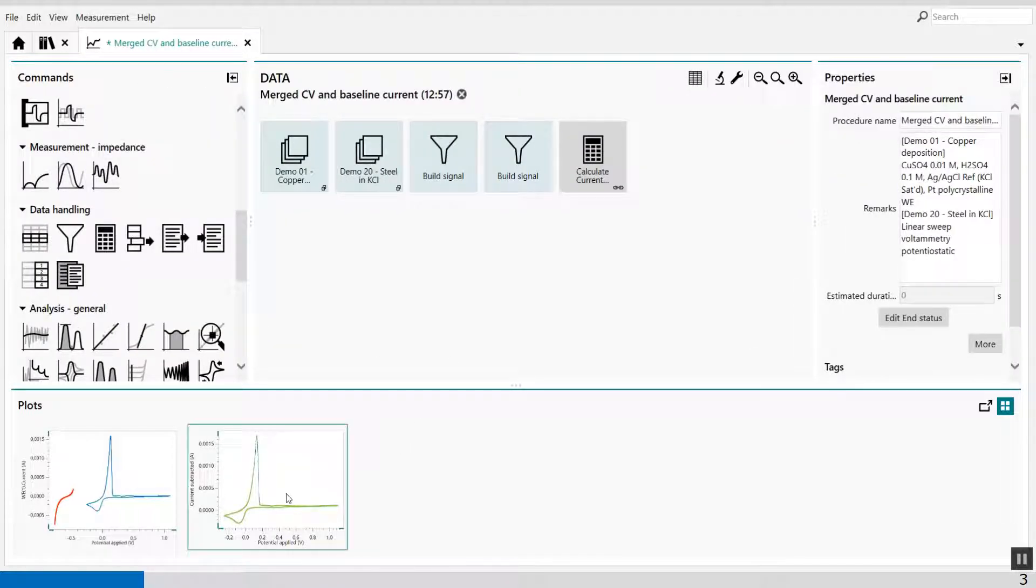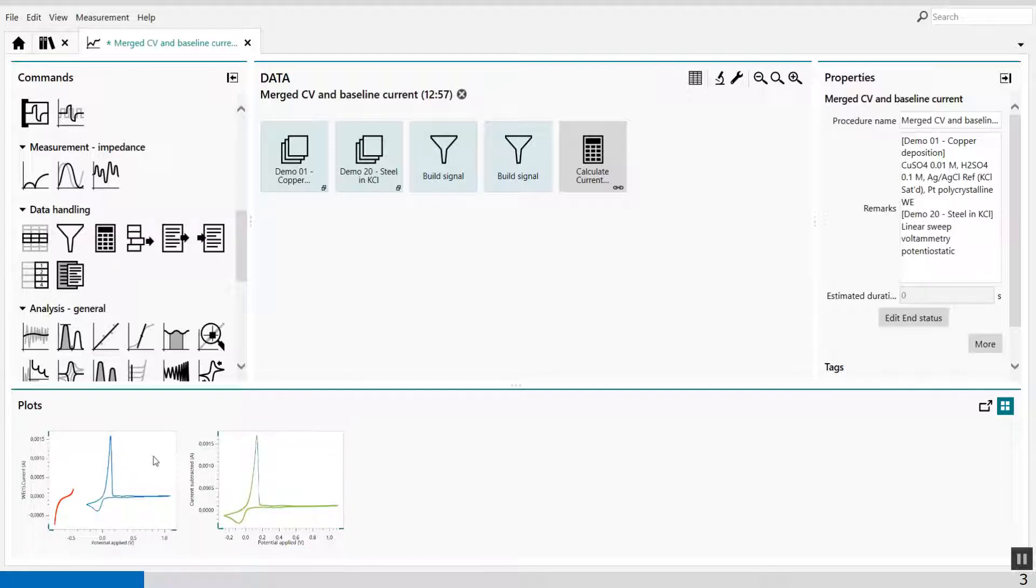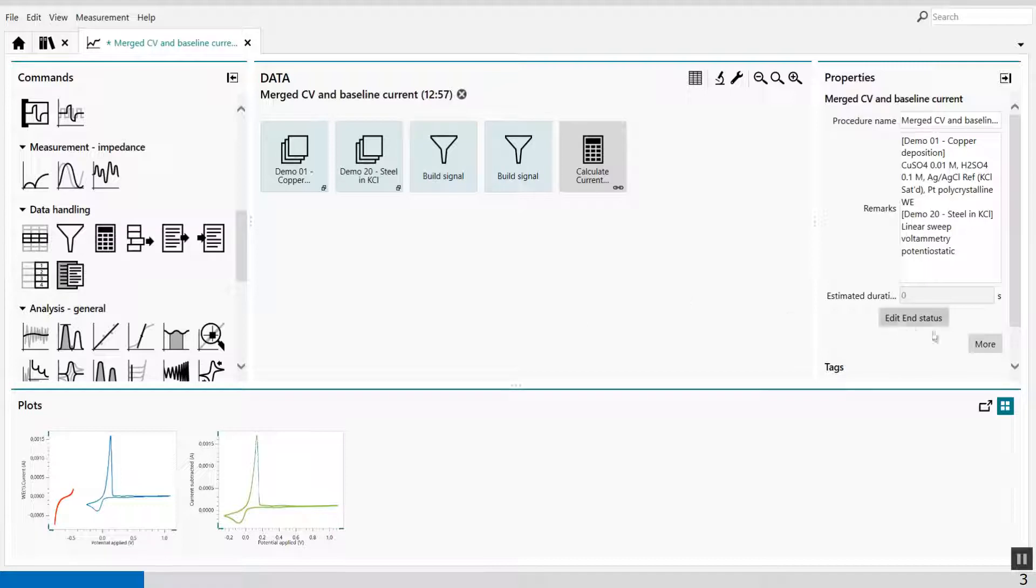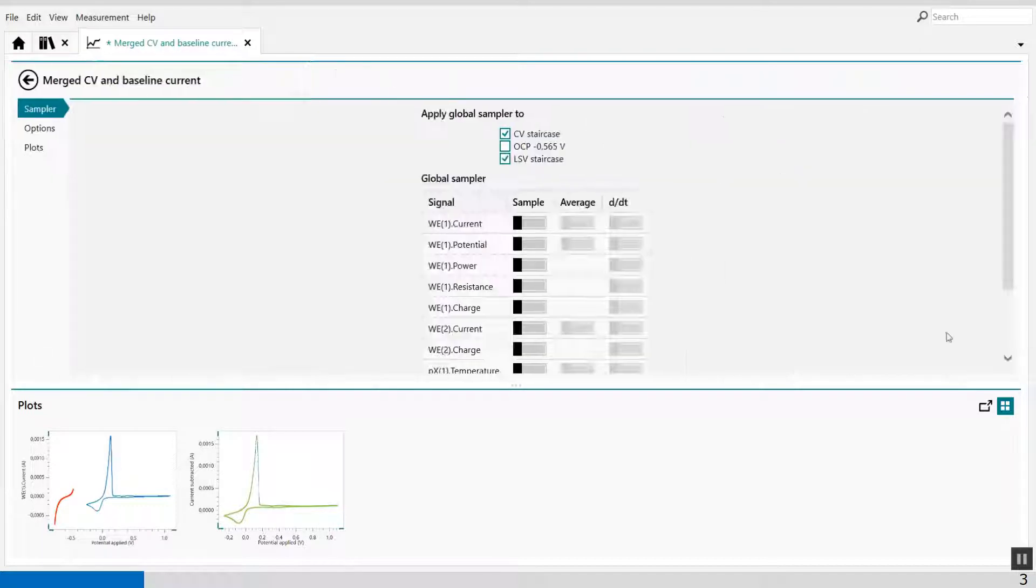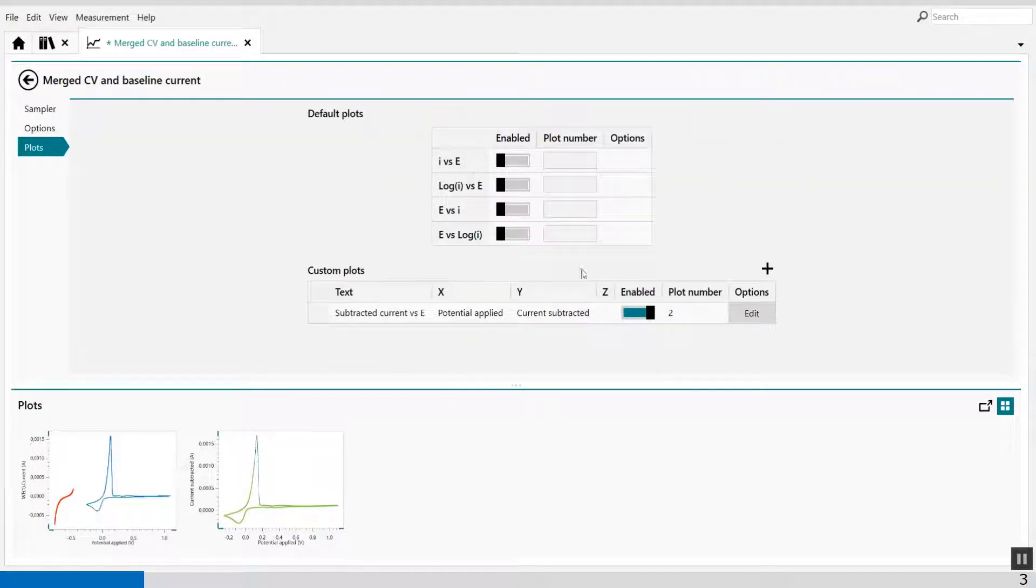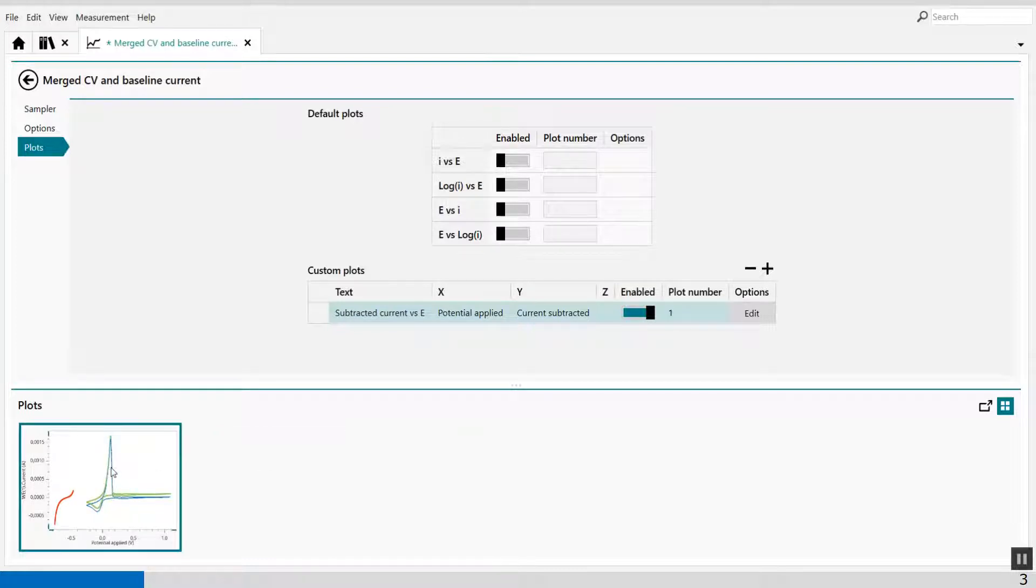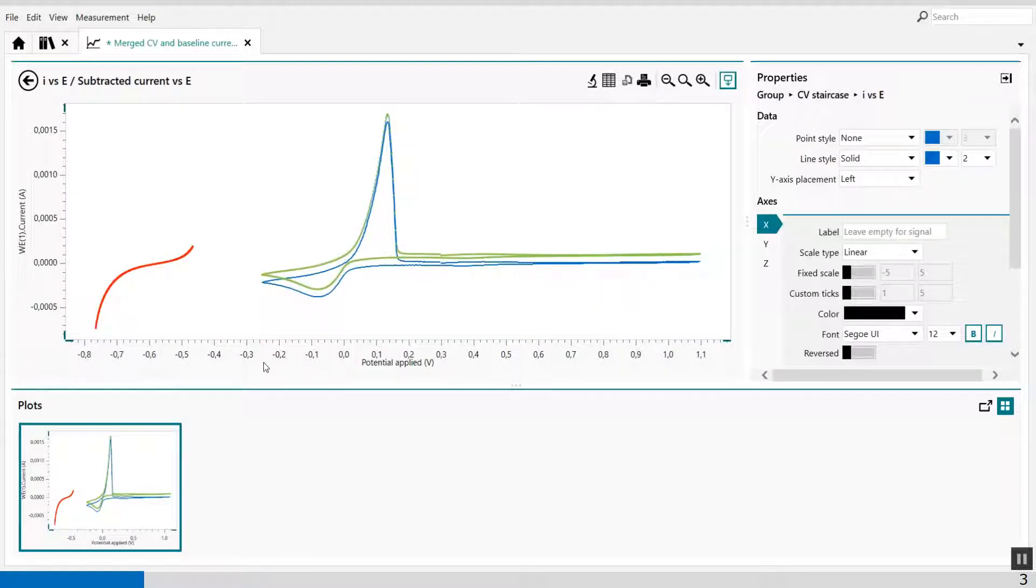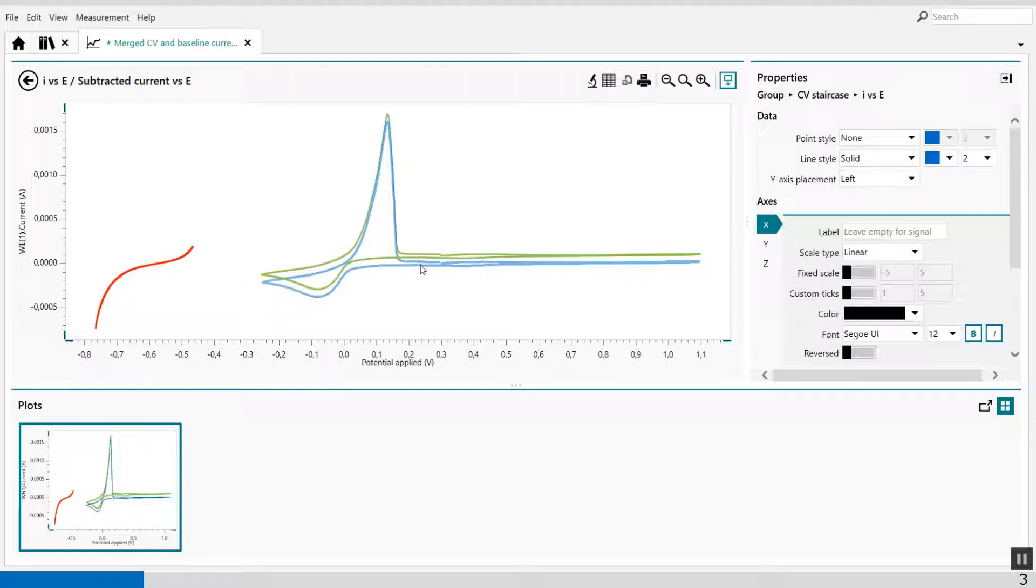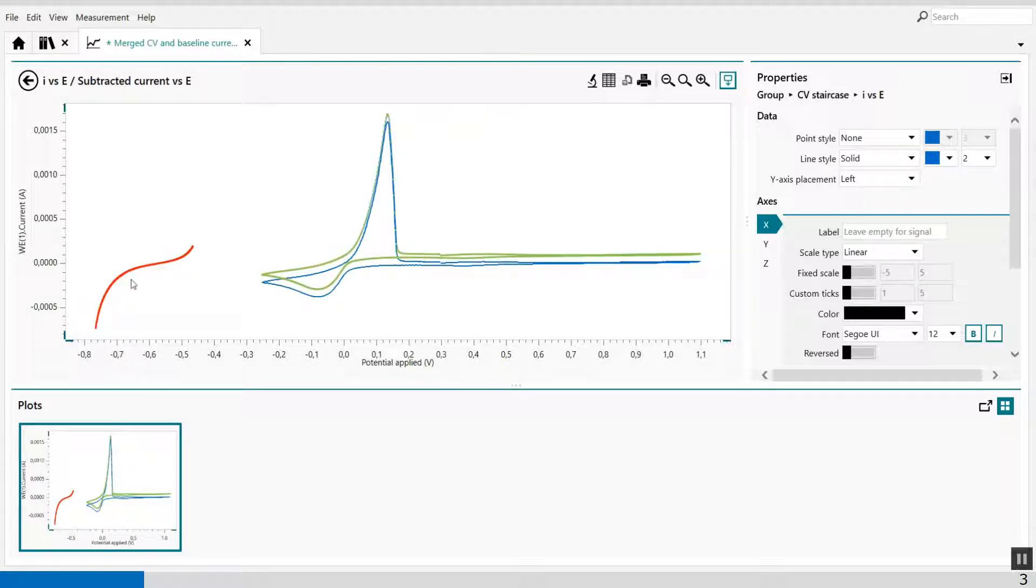When I want to have this plot also in this same plot, in plot number 1, I can go put this plot in plot number 1 to overlay. You see, both plots are now overlaid on top of each other. The blue line is my original CV, and the green line is with the subtracted current of the average value of the LSV.